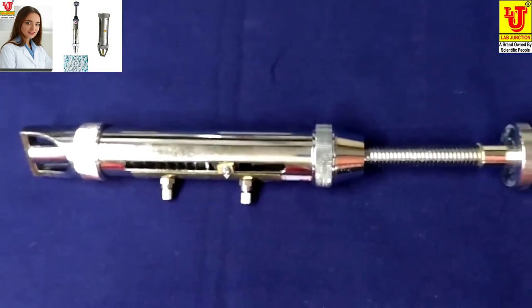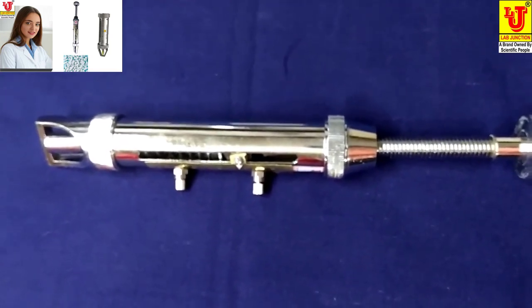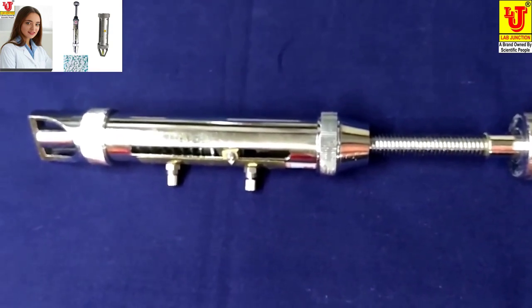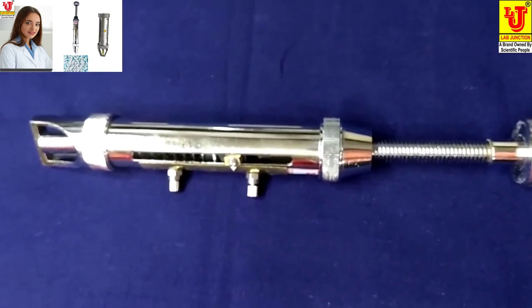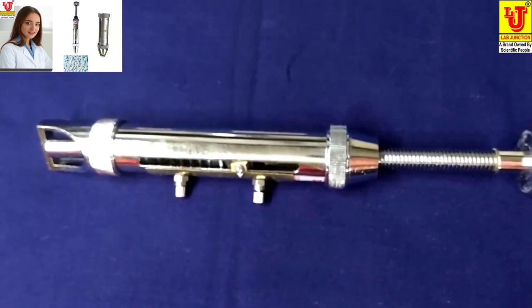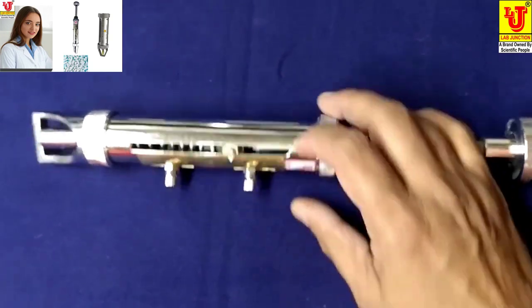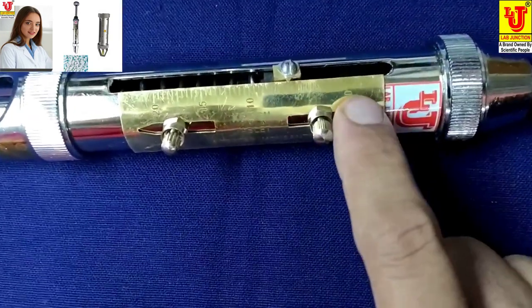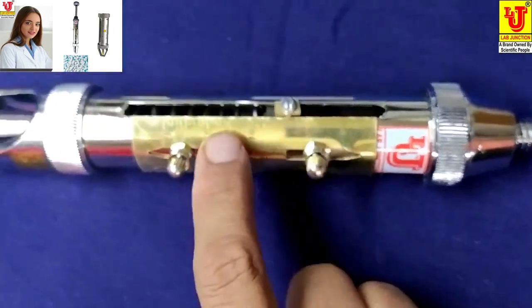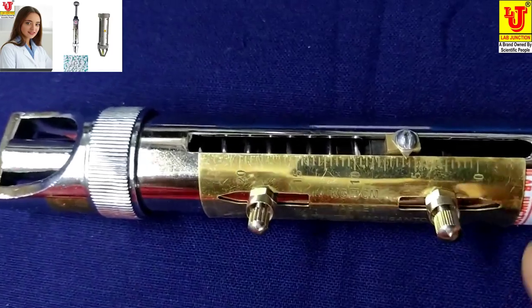This is a fairly handy instrument for taking quick readings for the hardness of tablets. It is made of brass turned parts, heavily chrome plated. The scale is 0 to 20 kg, and the index mark and division is in 1 kg.